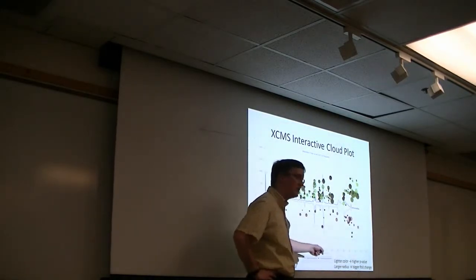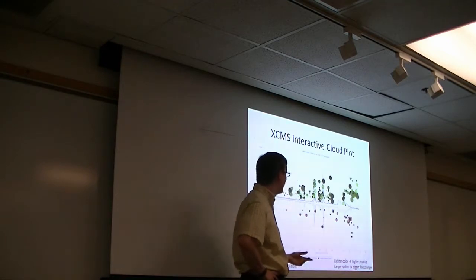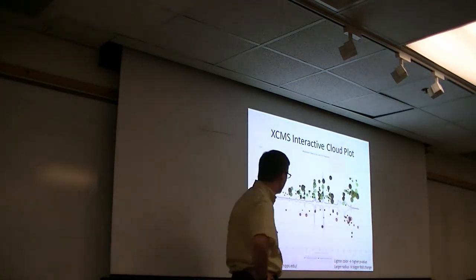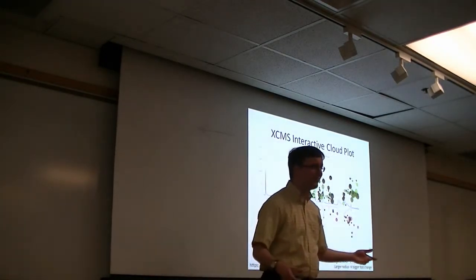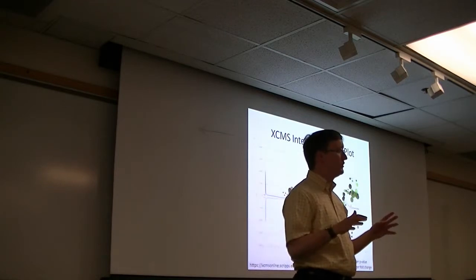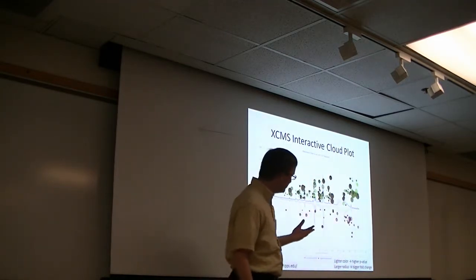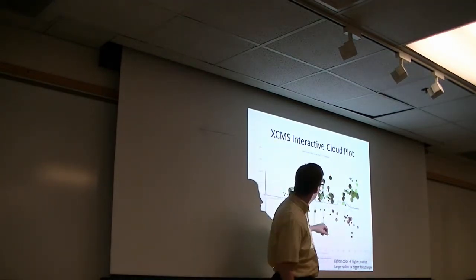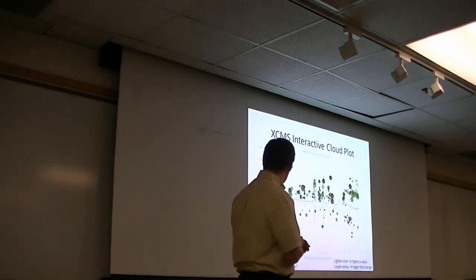The color is going to be associated with the p-value. So the lighter it is, the higher the p-value, right? I think it's actually the higher the negative log p-value is. And the larger the radius, the bigger the change. So it's kind of the same information as the volcano plot, but they're showing a lot more behind it. And you also get some sense of where the most ions were seen. There's some really strong signals in here, for example, that differentiate this.